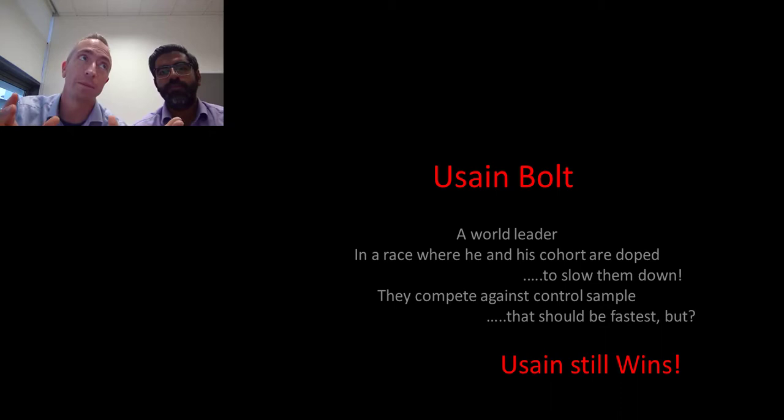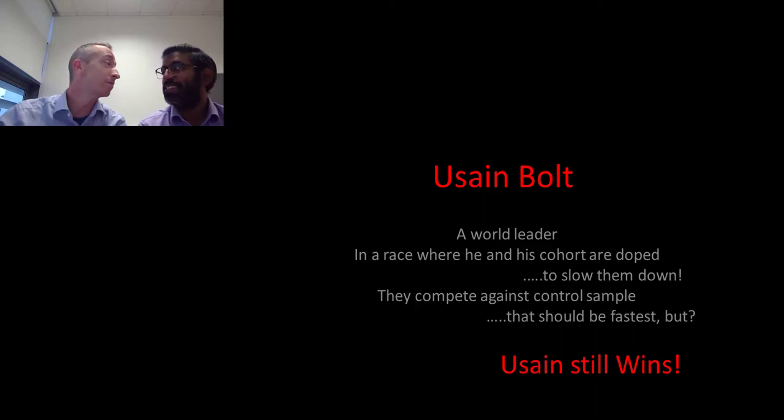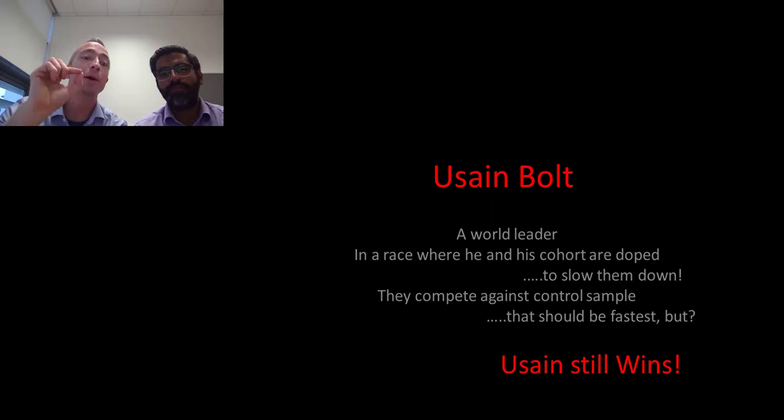You can actually watch the fate of the cells, which is when we came across the next cell that we called Usain Bolt. Now, Usain Bolt, because he too is a world leader. Now, I don't like to be beaten, and I'm about to race Usain Bolt. So we thought it'd be a good idea here to actually give him some drugs, doping, but not to speed him up, but critically to slow him down and all his cohort within that population. Of course, being a true scientist, we will now compare that against a control sample that have had no drugs whatsoever. Do the race, what should happen? Usain Bolt still won the race.